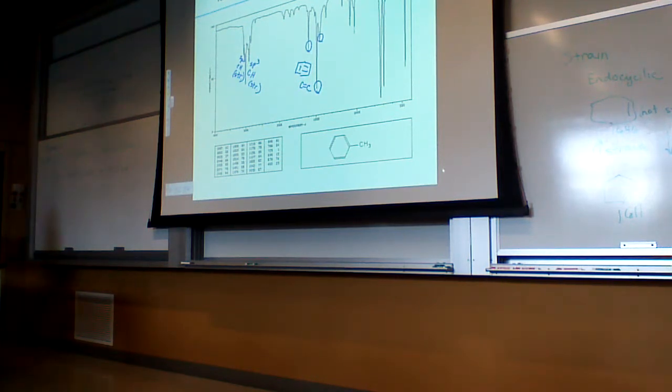Within this region, we also saw the CH bending. You remember we had a CH bend right around 1450, so one of those is also the CH bending. Probably, I'm not sure which of these two, to be honest. That's the CH3 bend. So those three, we can assign.